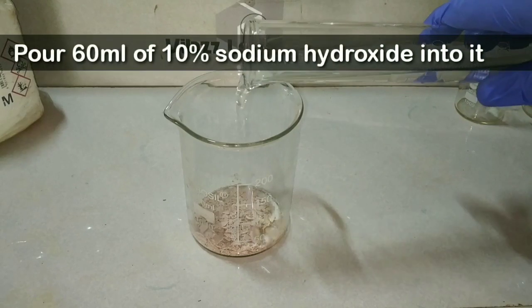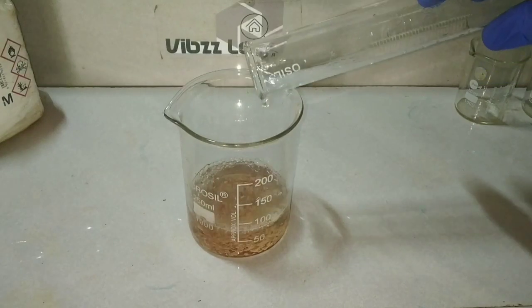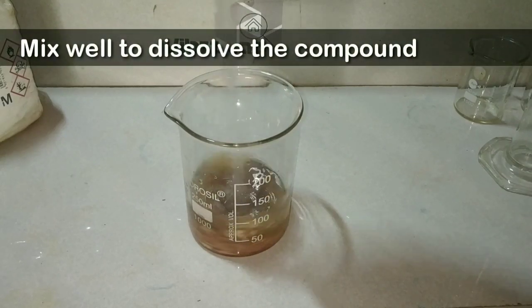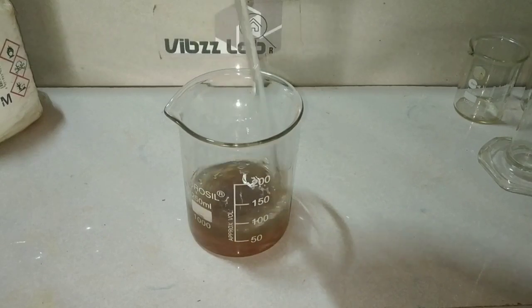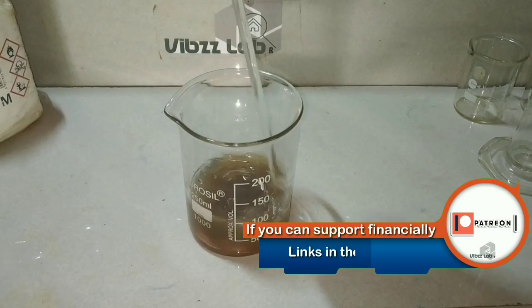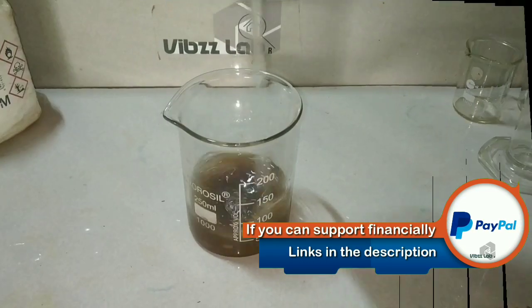I am using 60 ml of 10% sodium hydroxide solution, which was made by dissolving 10 grams of solid sodium hydroxide in 100 ml of distilled water. Mix it well to dissolve the beta naphthol. On dissolution, the solution turns darker, and on complete dissolution it attains a dark brown color.